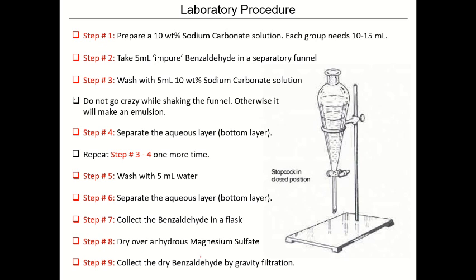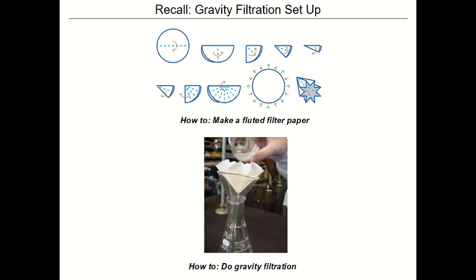That's very important to remove the small amounts of water that we have in that solution, right? So that the organic phase is completely free of water. And after that, we filtrate. Okay, as you can see here, we need to make a filter paper by doing these steps, or use a circular filter paper, right?